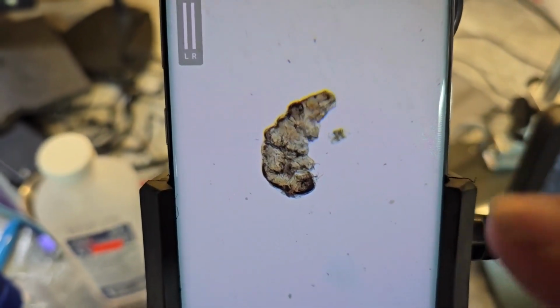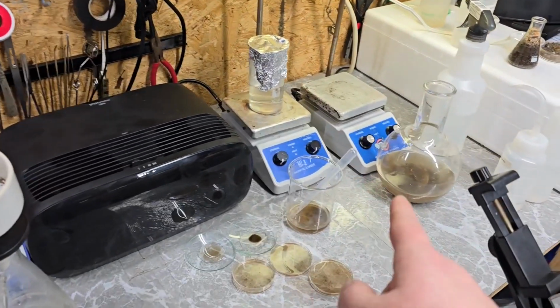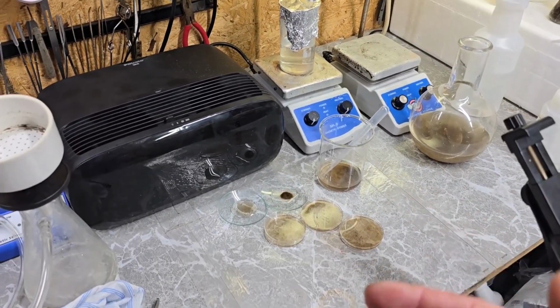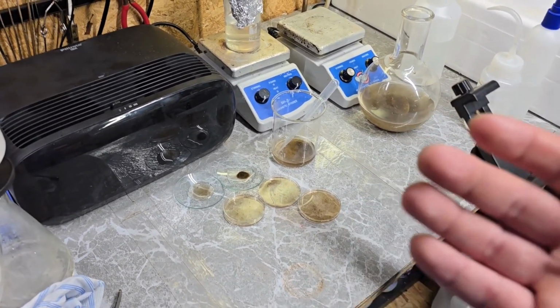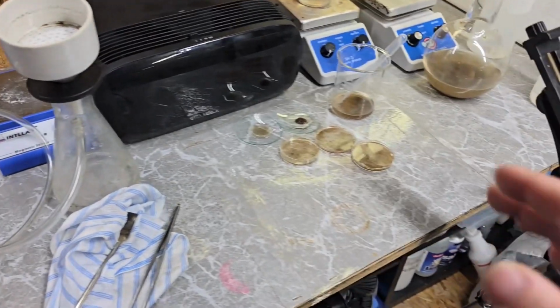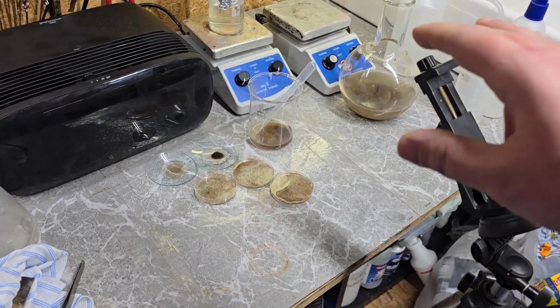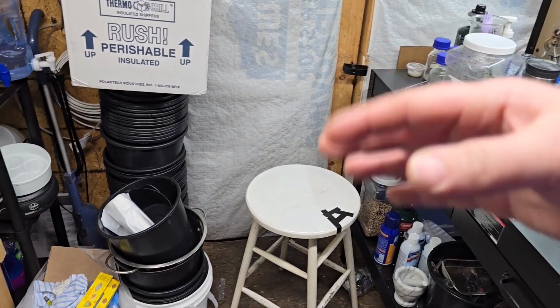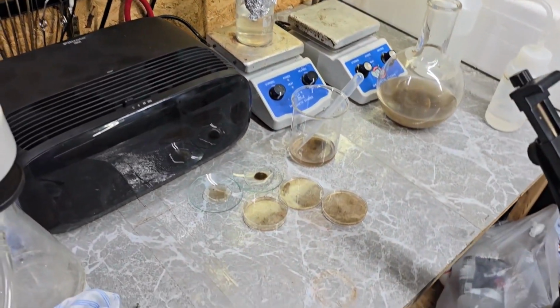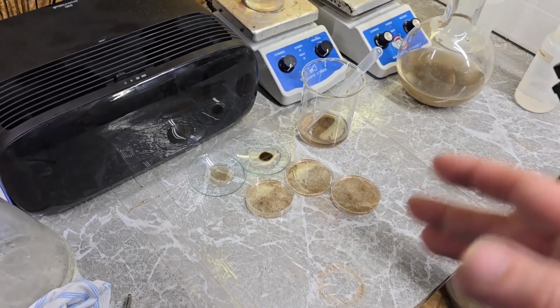I'm going to put him back in the big flat bottom boiling flask over here before that drop of water on the slide dries out. That way he'll be fine, although he will be fine even if he dries out. After I'm done looking at stuff out here, I'm going to take all the water that I accumulated from this little experiment, as well as the moss right there, and put it outside underneath some shaded trees. That way, whatever is growing in here can just continue to live its best life.